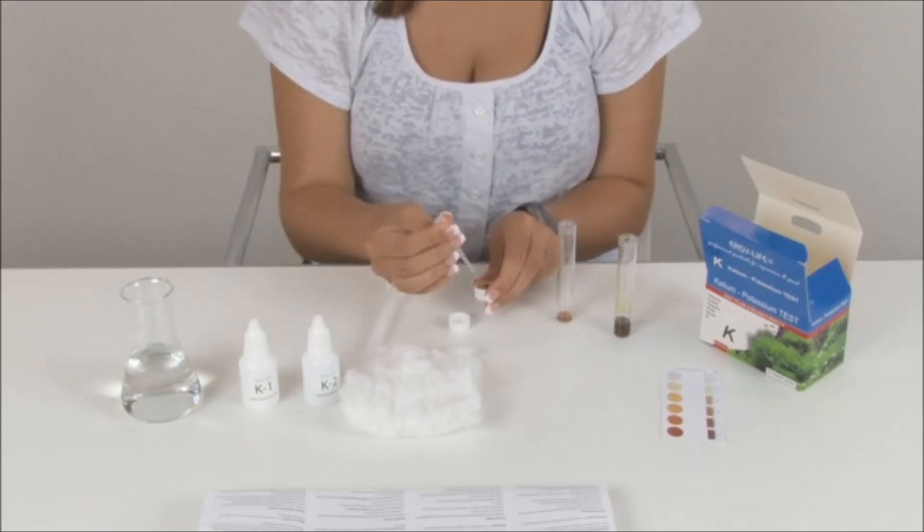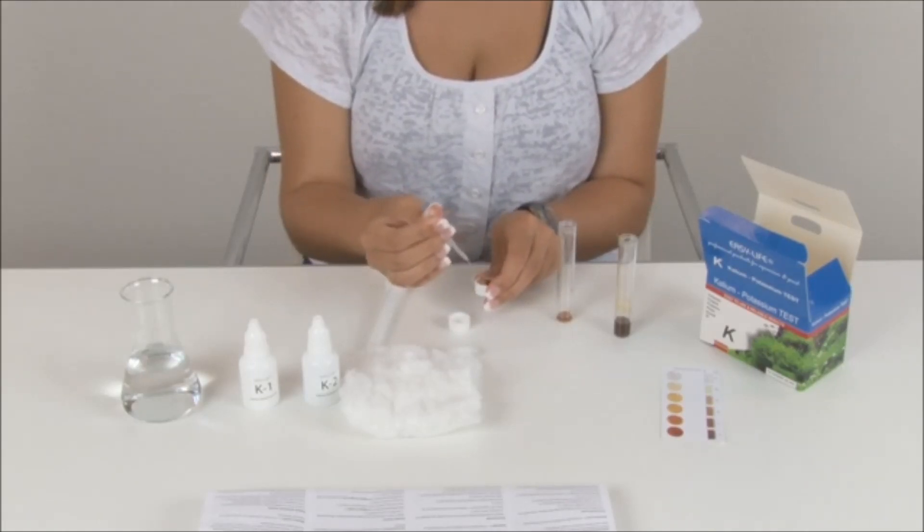In case of too little liquid, repeat the procedure and collect some more clear test liquid from the cotton.